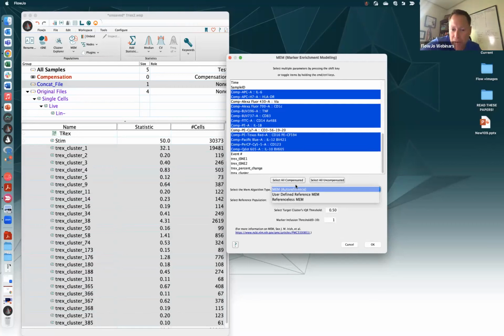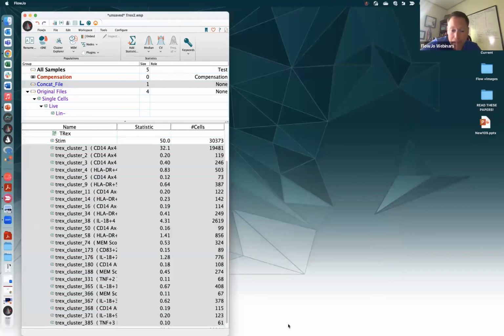So I like the auto reference. I'm going to pick that now. This is just that safety catch-all for the divide by the difference in interquartile range, so we make sure that it doesn't blow up and go to infinity. And here's: how big does the number have to be for me to consider it interesting? Let's go with 2, so I've got wiggle room to go down if I want. Here's the reference to the paper that originally came out of the Irish lab, and I'll say okay. And there you go. That's fast.